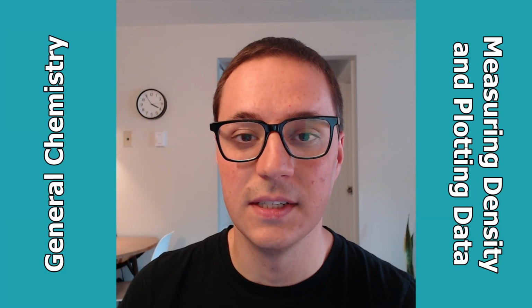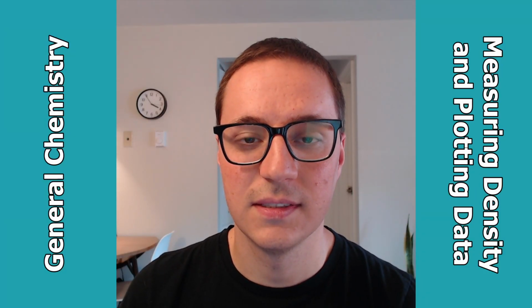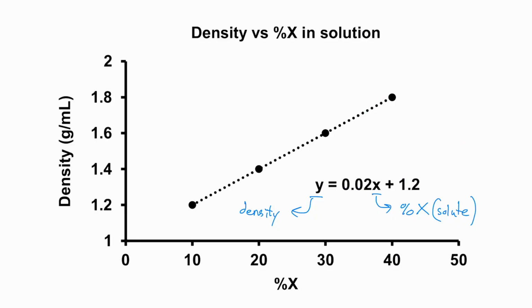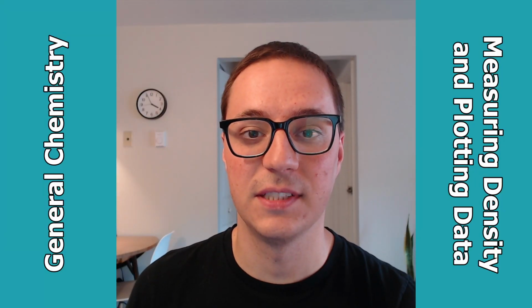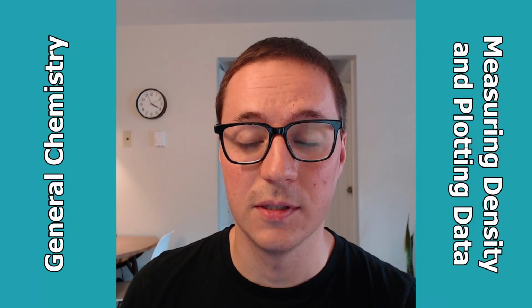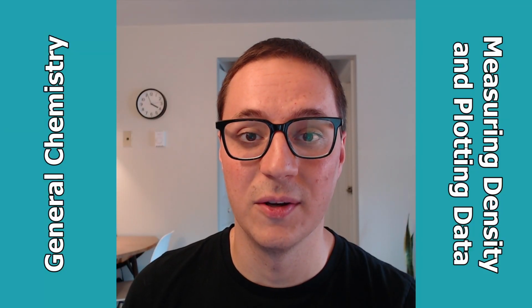I know what the density of my unknown solution is, since I can measure both the mass and the volume of it. However, I don't know what the %x is in my unknown solution, since I can't measure that directly. Using the equation of the standard curve, I can plug in the y value for my unknown solution as the density, and simply solve for x, the thing I don't know. In this way, I'll be able to determine the % solute in my unknown solution.